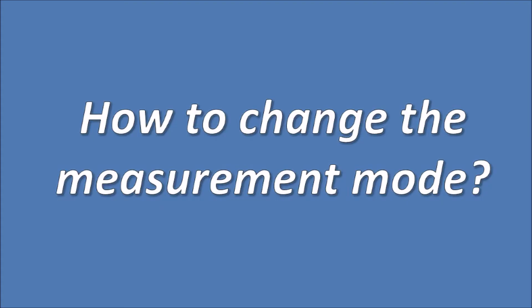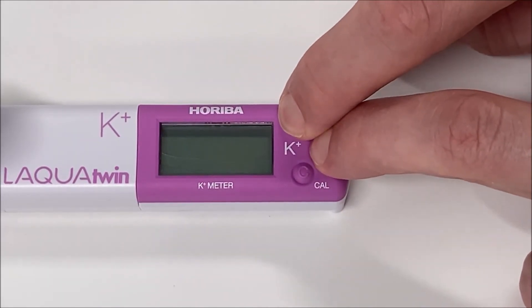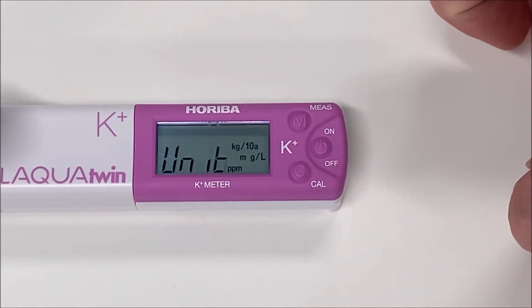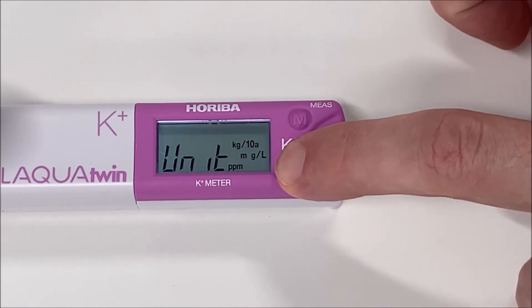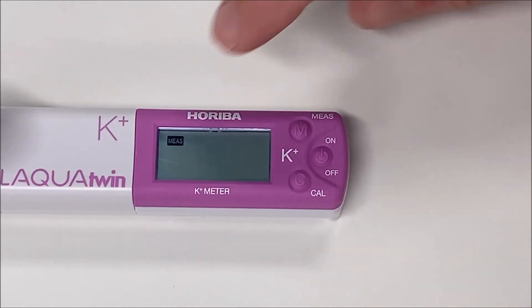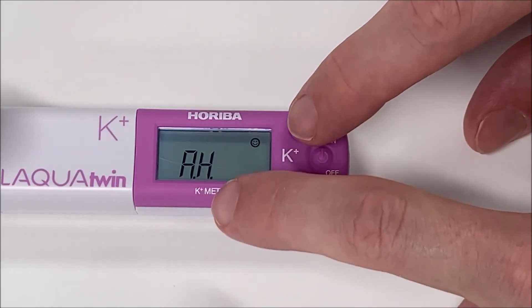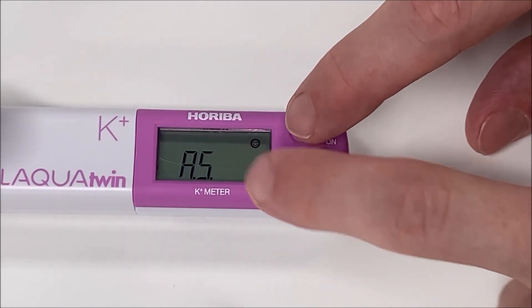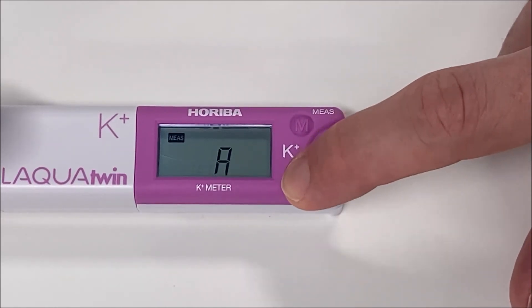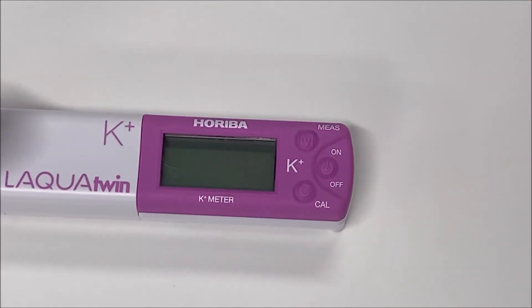To change the measurement mode, switch the meter off. Press and hold the measurement button and the on-off button simultaneously until the display switches on. When UNIT appears on the screen, press the CAL calibration button three times until the icon MEAS appears on the screen. Then press the measurement button. At this stage, you can switch mode from Auto-Stable to Auto-Hold by pressing the measurement button again. To confirm, press the calibration button three times until the meter switches off.